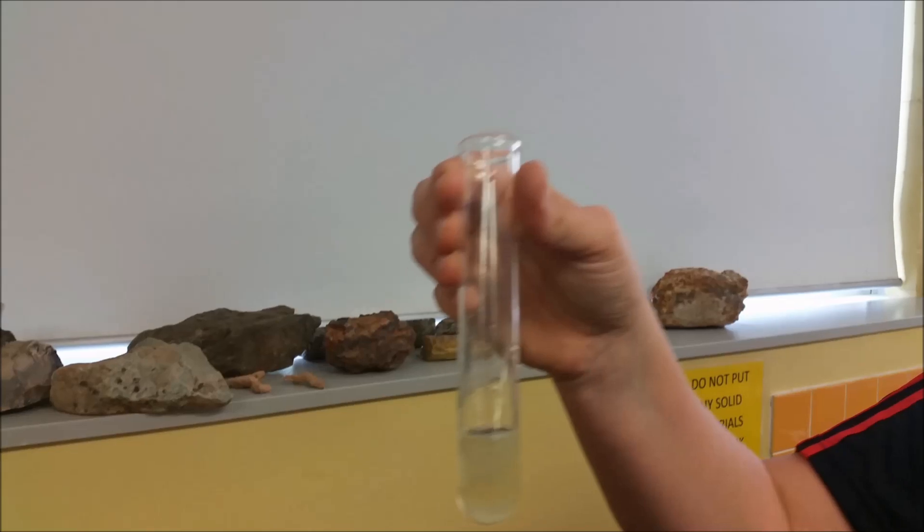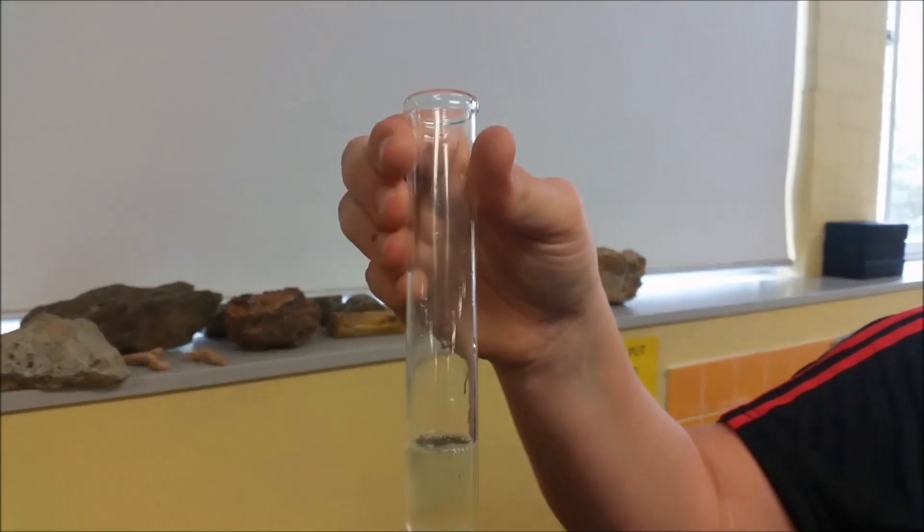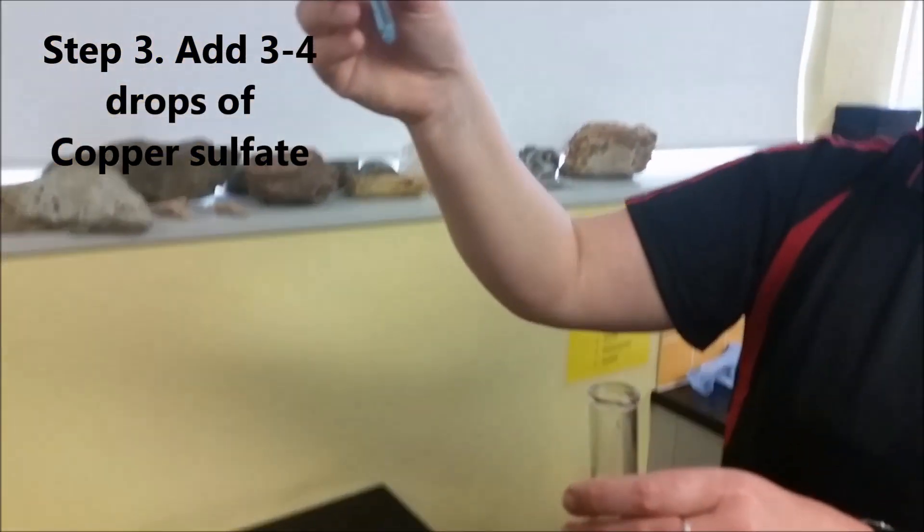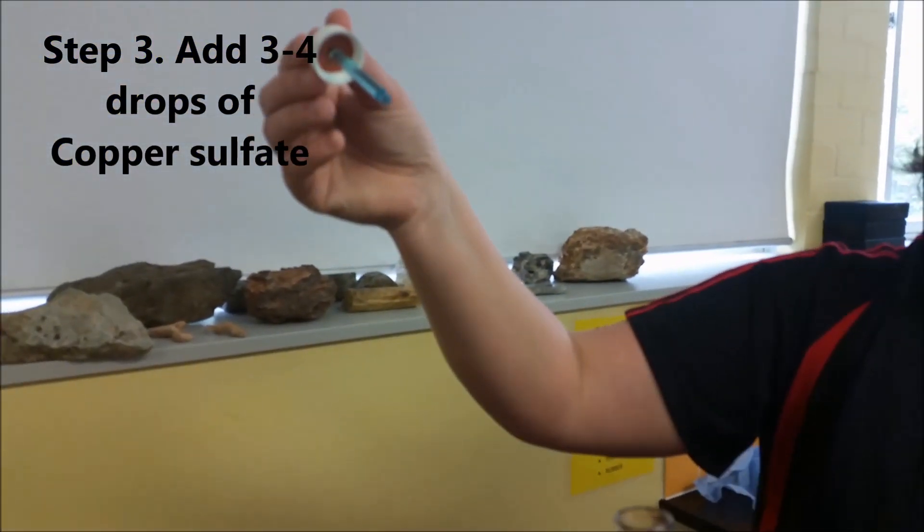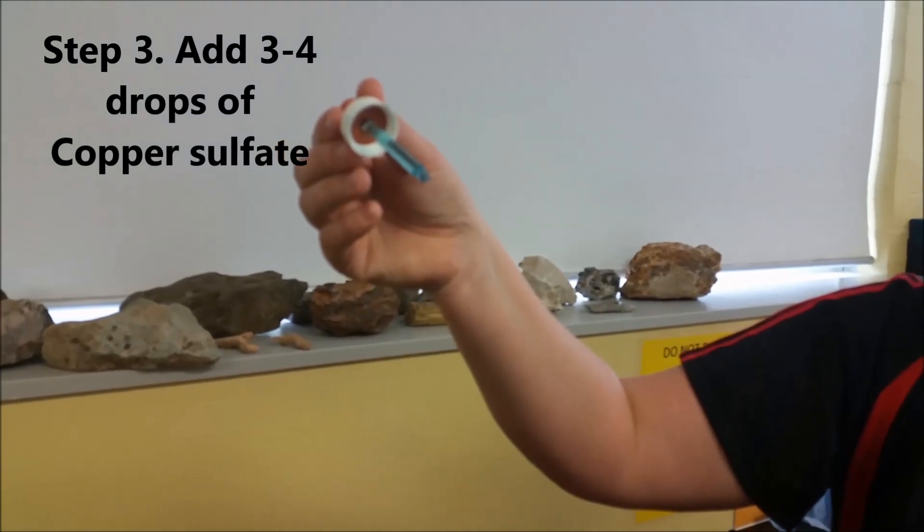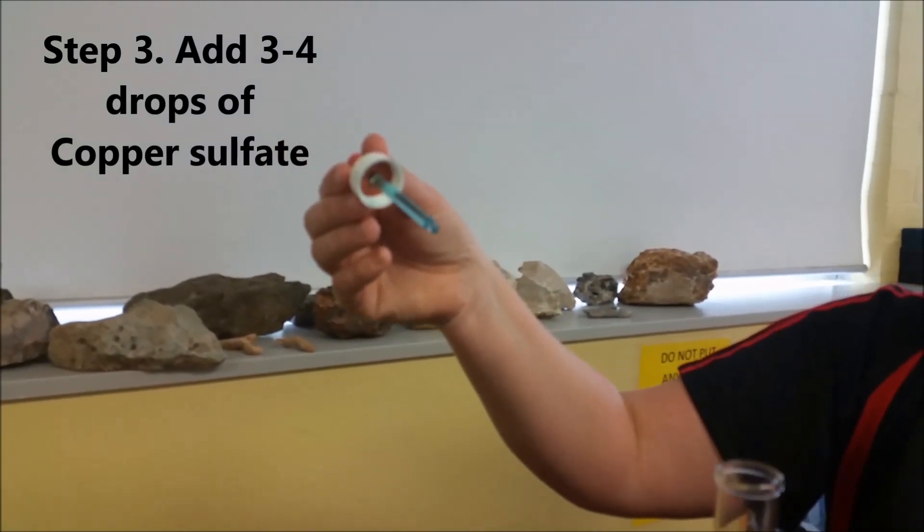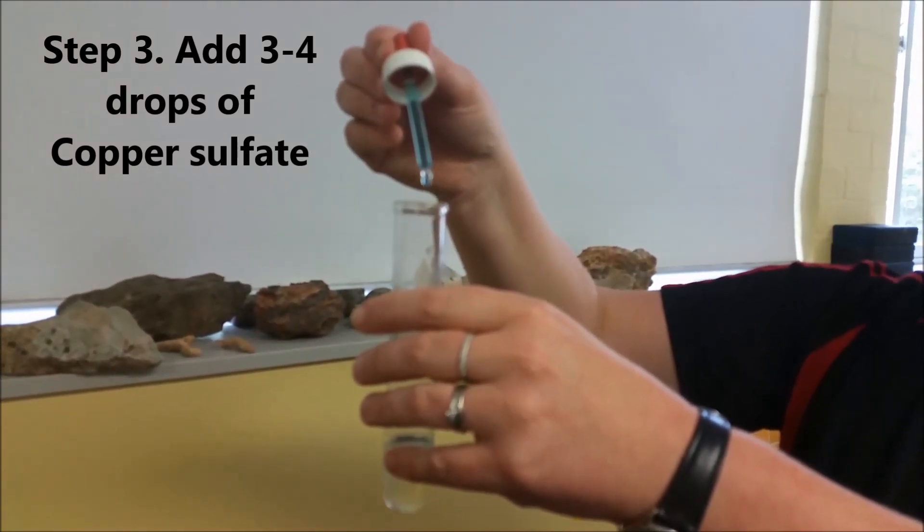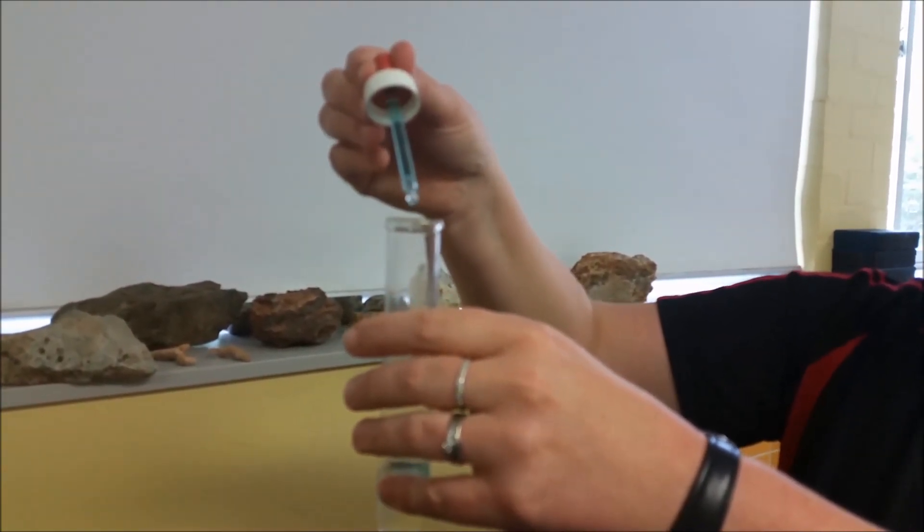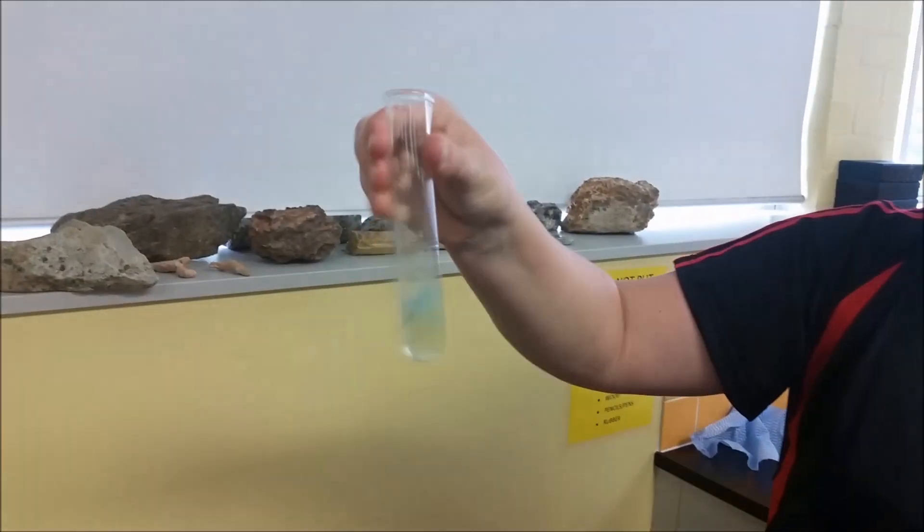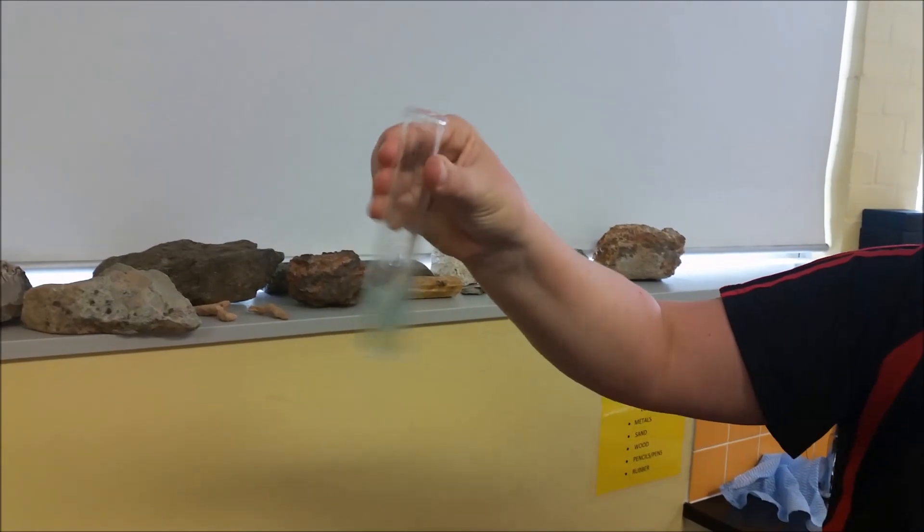And then you add the second reagent, and this is important to add it in this order. The second reagent is copper sulphate. You guys have seen this before, it's that blue solution. But you only need about three or four drops of this. So the sodium hydroxide, one pipette full, mix, then three to four drops. I might do a little bit more because I've got quite a lot of the copper sulphate. And then give it a mix.